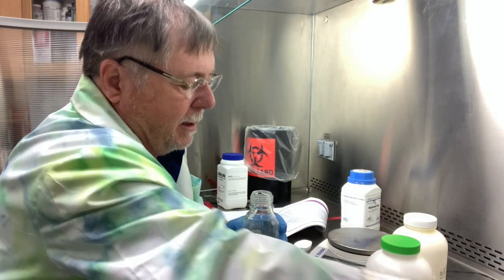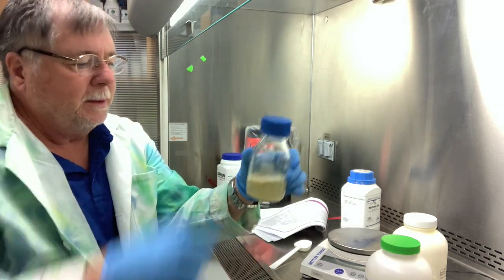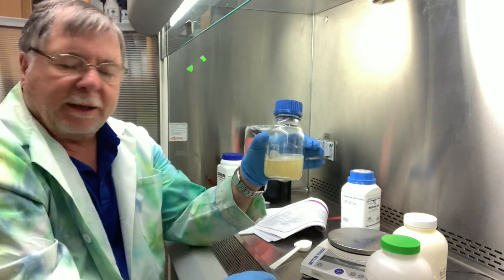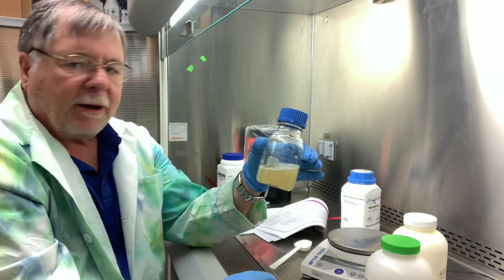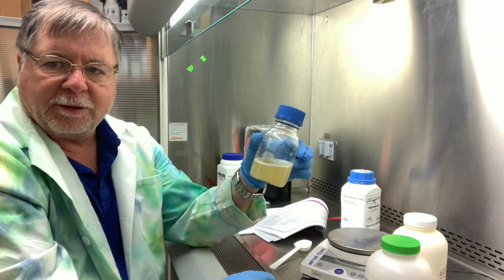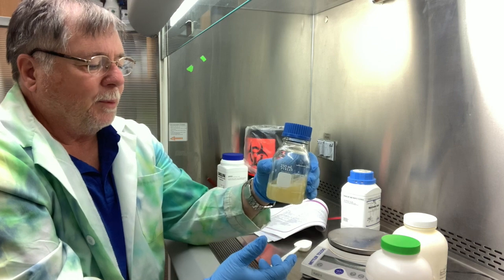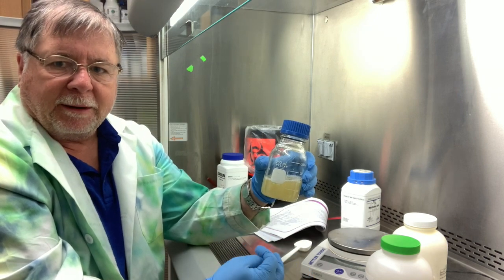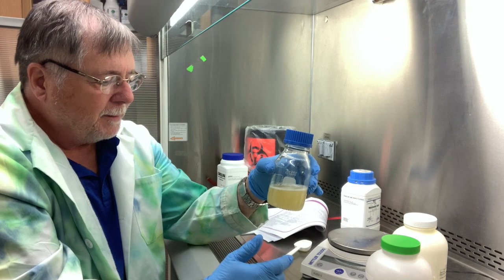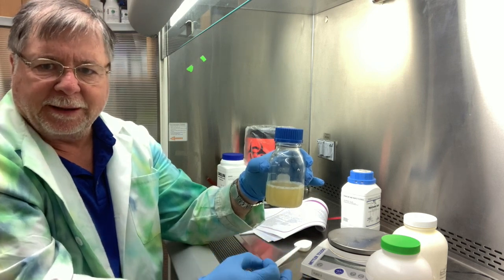We pour that. And one thing I want to point out, agar does not dissolve unless it's boiling. Okay, and we don't have to worry about it. We just need to mix it up a little bit, but it'll never go clear. And so when we get this in the autoclave, which we have to sterilize it, it has to get up above boiling temperature. It's going to be 121 degrees Celsius with the pressure of the autoclave. And so that water boils at 100 degrees Celsius, so it's going to be well above 100 degrees. And so we're going to be able to make this very soluble, and it'll come out as clear. It won't be colorless, but it will be clear. You can see through it.